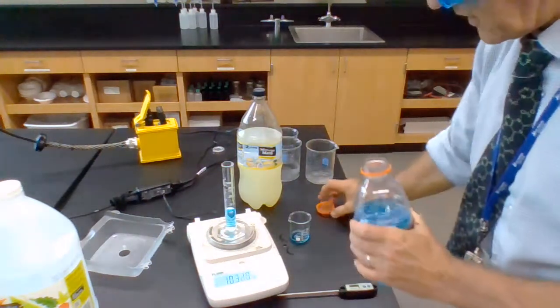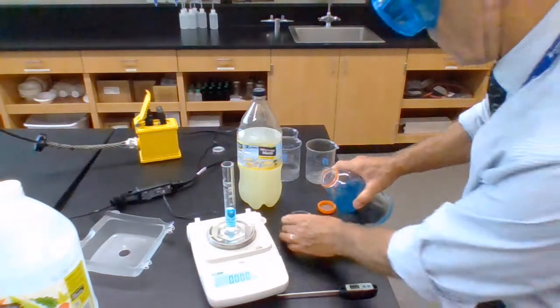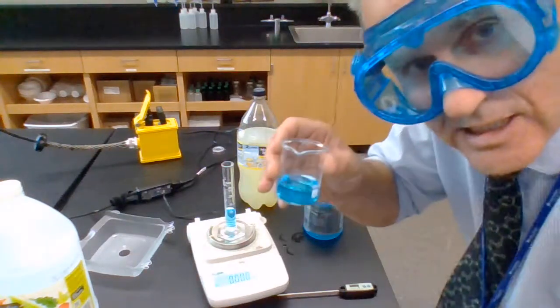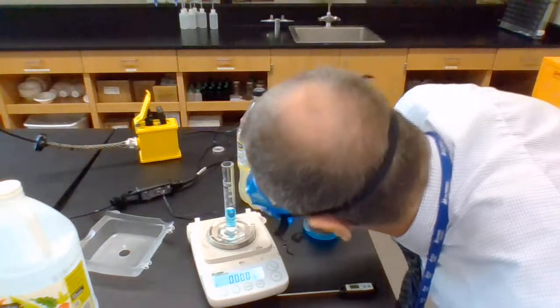And we don't need to do anything to that. Let's zero it. And that's a 0. We don't care about what that is because we're now going to put another 10 milliliters up here, which means my next bottom of the meniscus measurement has to be at 20 milliliters.